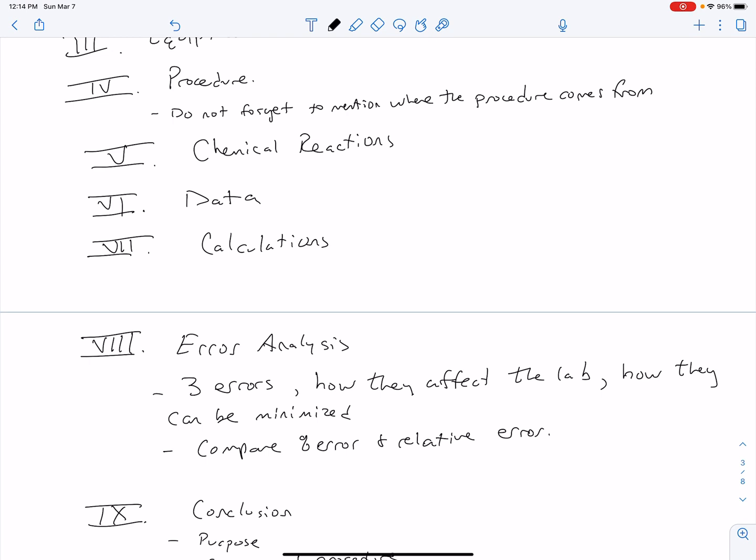If it's less than 7.5, well, a lot of times people will say, well, you under titrated. Well, here's my question. Did it change colors? If it changed colors, you can't under titrate. So that can't happen. So now you got to look to other things. You got to look to your bleach itself. Was the bleach itself old? I don't know when I bought it. I mean, I know when I bought it, but I don't know how long it sat. Bleach degrades over time. And so as bleach breaks down over time, the bottle may say 7.5, but it may really be 6.75 or something like that.